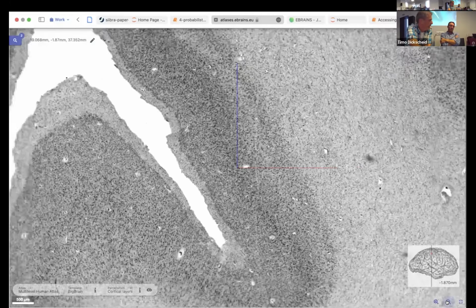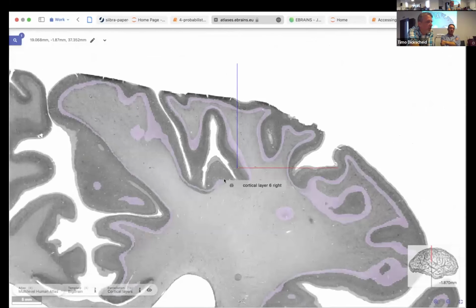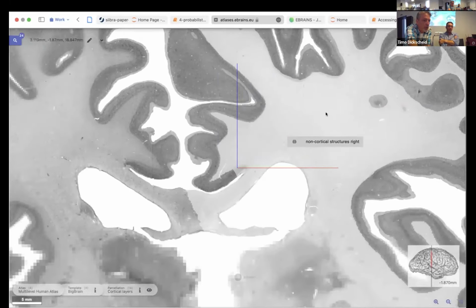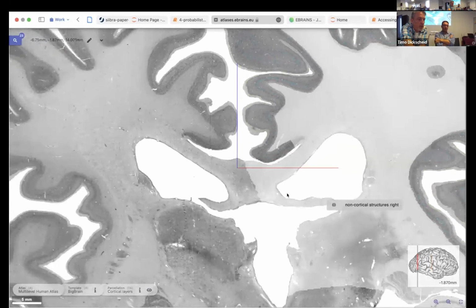Okay, is there anything more you want to add for the BigBrain here at this point? Do you want to show another region? Okay. Or a region that we can see? Yeah, we want this. Yes. Okay.